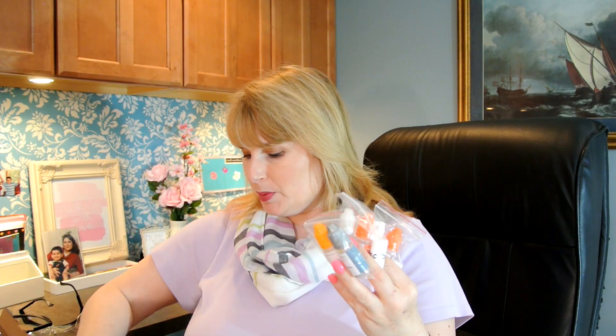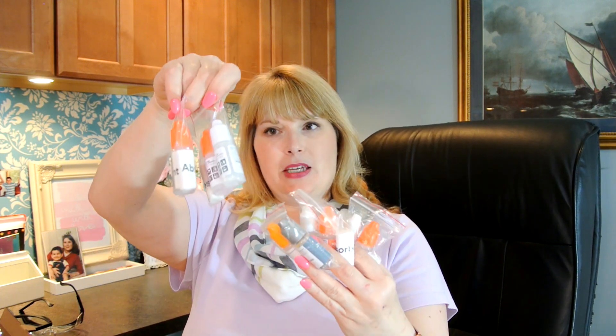And then here you have a battery supply case with wires, safety gloves, plastic stoppers, small petri dishes, and then all of your chemicals: sodium hydrogen sulfate and tin chloride. You get several of them — five packets of these — so you can do multiple experiments.